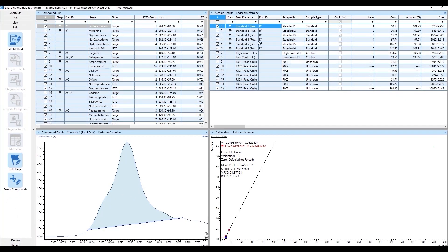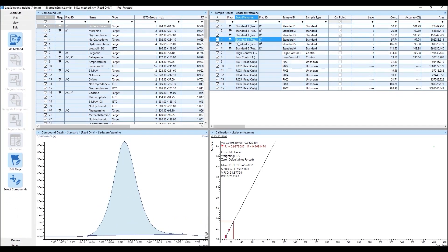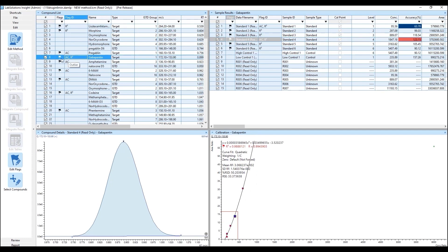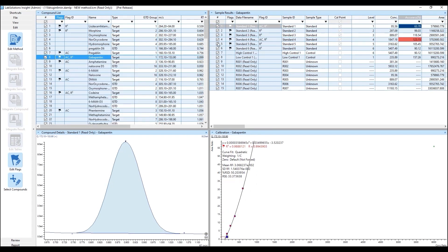Samples and compounds that are flagged will be highlighted with the color corresponding with the flag parameter and value. Flag results are also colored differently for ease of use.